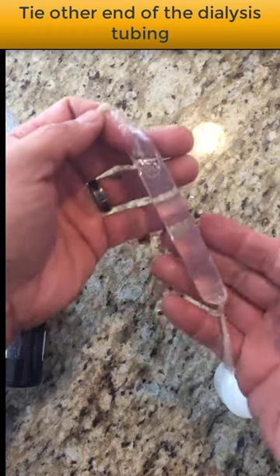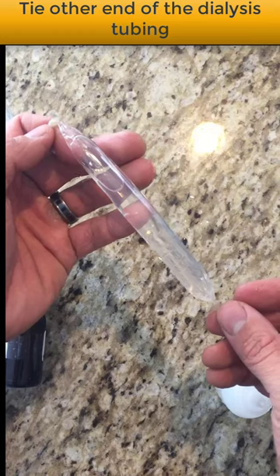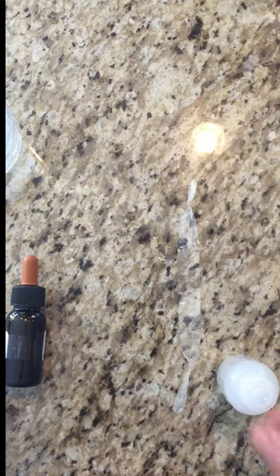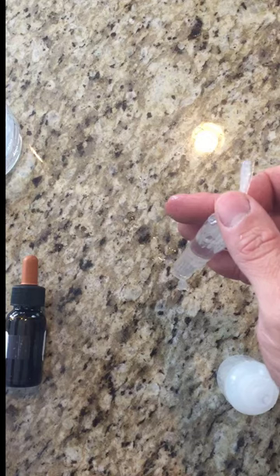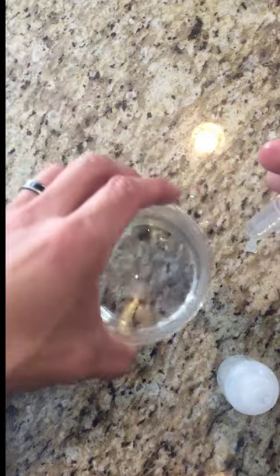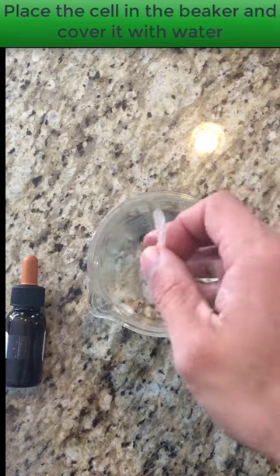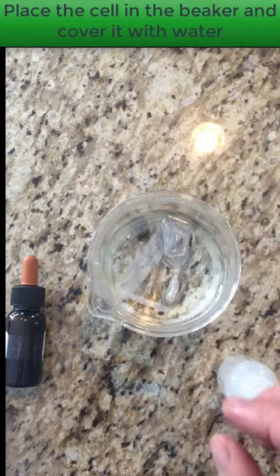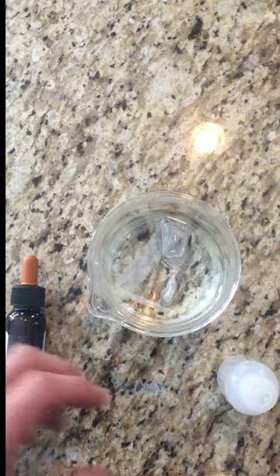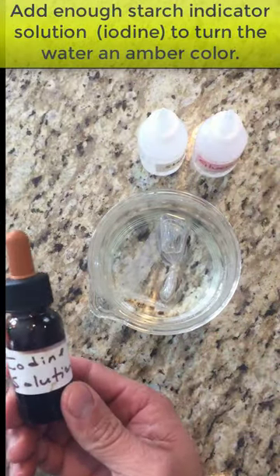After you're done, you're going to want to rinse the cell off. Hit pause on the video, go rinse off your cell, and come back when you're done. Now that you're back, we're on step six: place the cell in the beaker and add the water. I'm placing the cell in the beaker — I've already put water in it — and then I'm going to add the starch indicator solution.